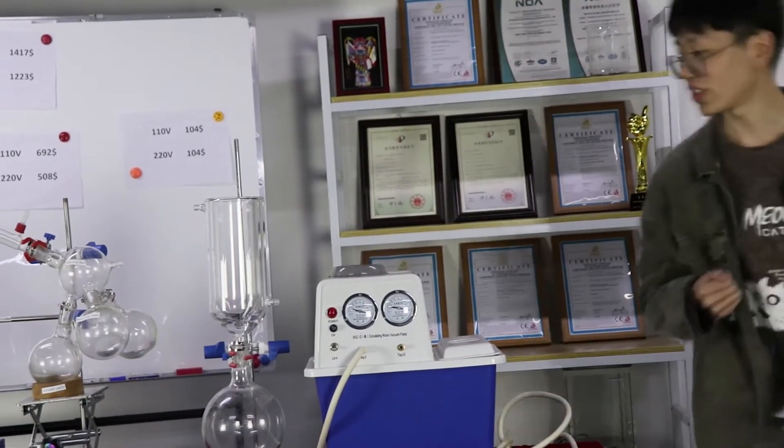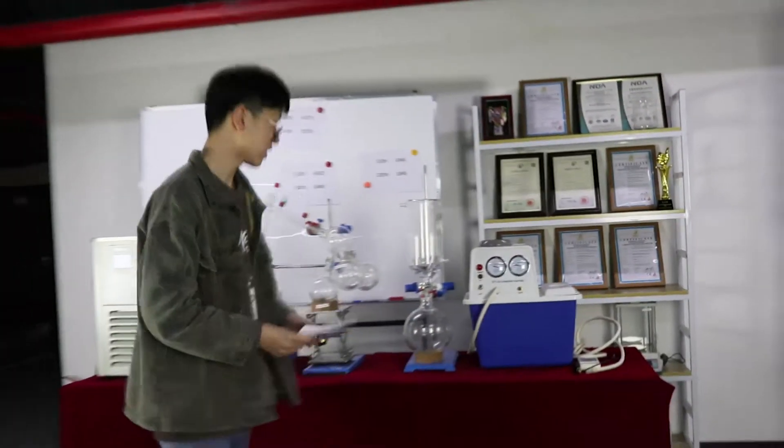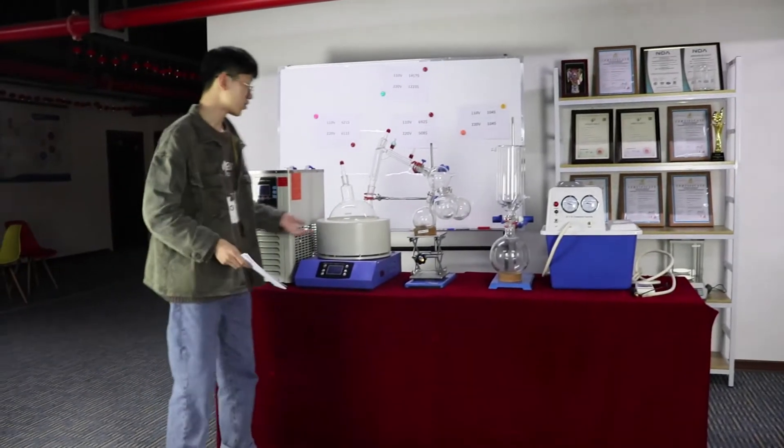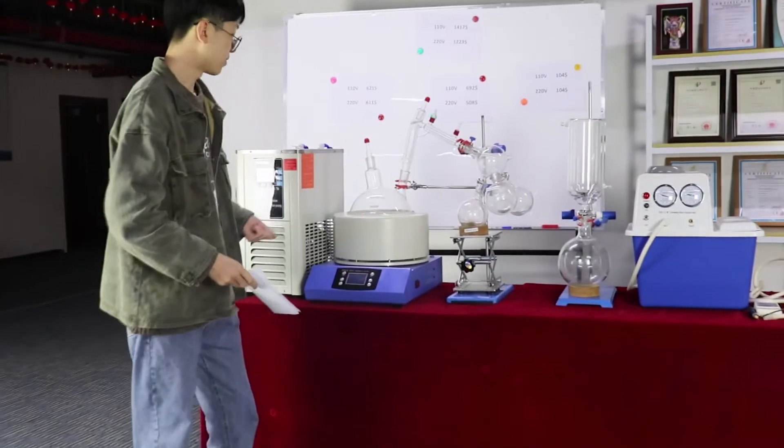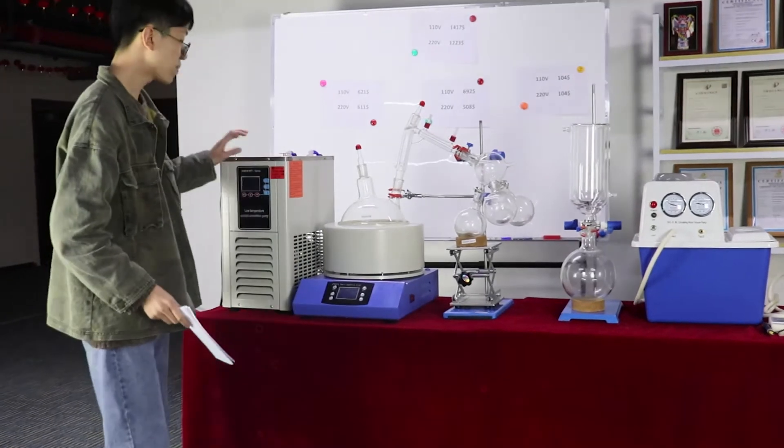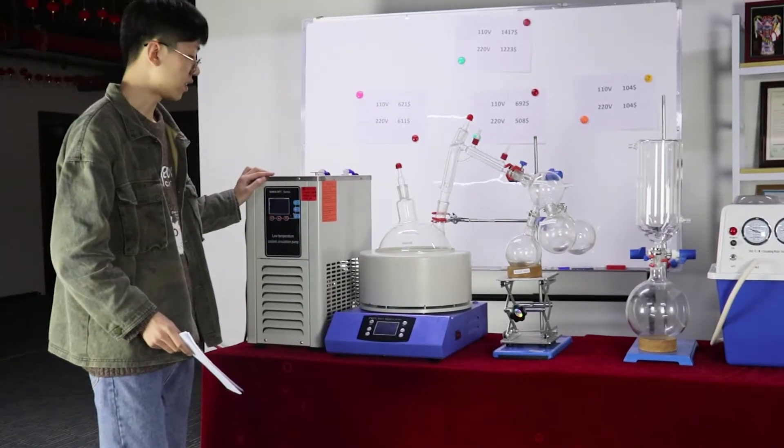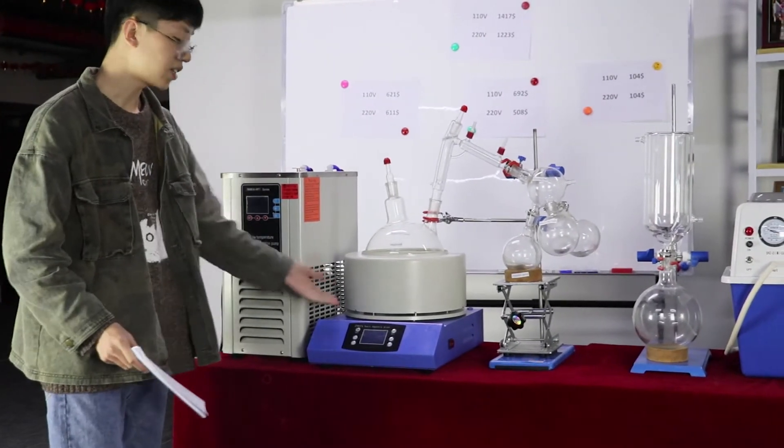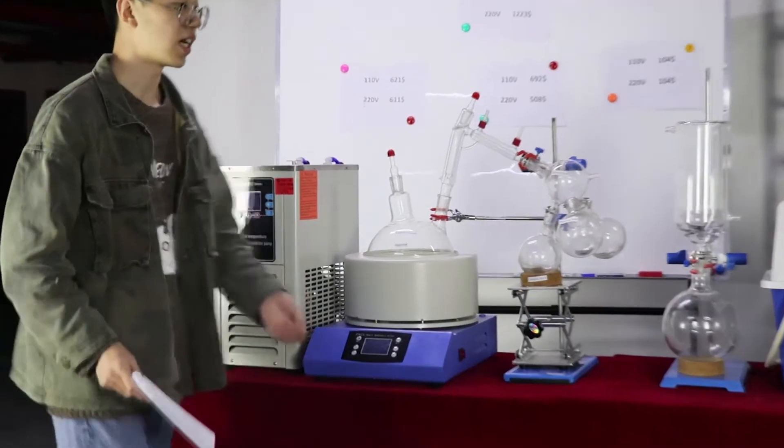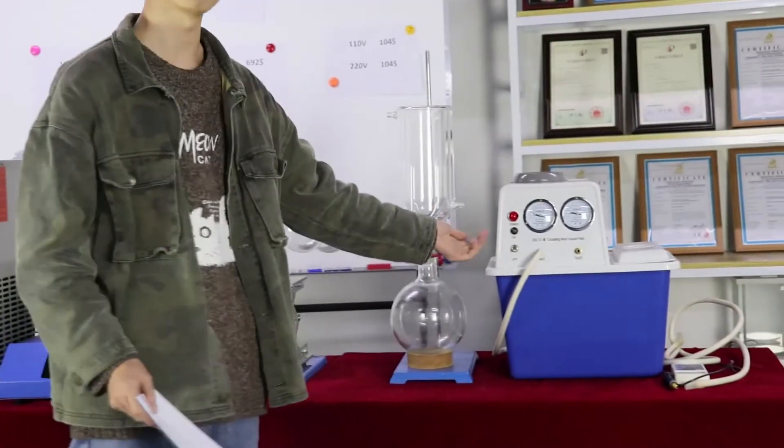Okay, as we say, this is the 5 liter short path distillation. This is my supporting devices: heating mantle, cooling chiller, and circulating water vacuum pump.